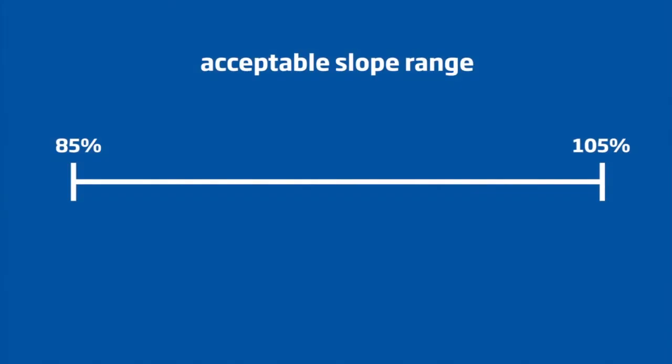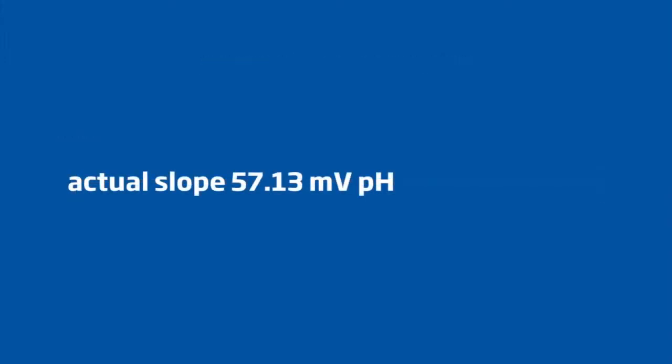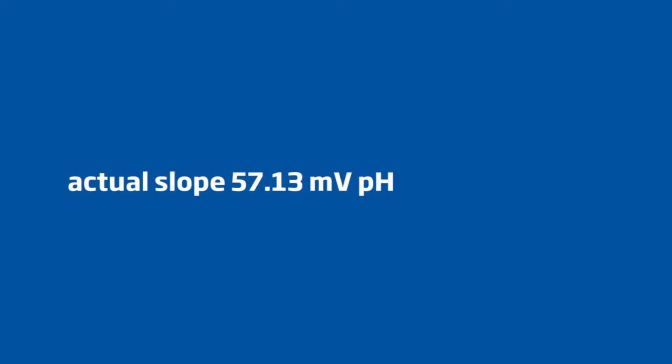The final step for determining the condition of your electrode is to make sure that these values produce an acceptable slope range. The acceptable range for a good electrode is between 85 and 105% slope. The slope of our electrode comes out to 57.13 millivolt per pH unit change.